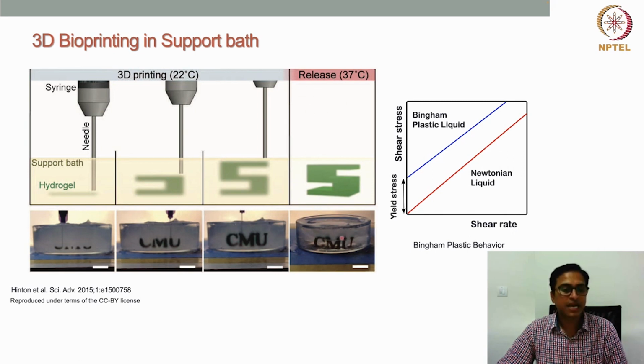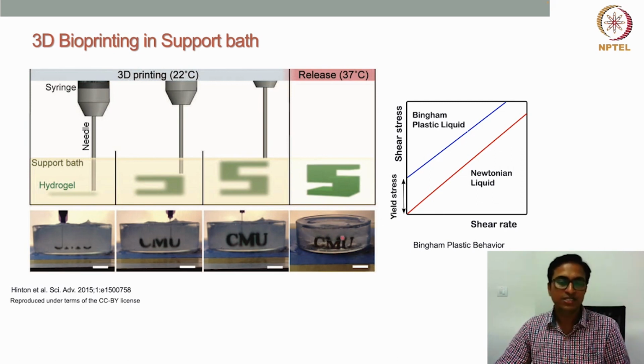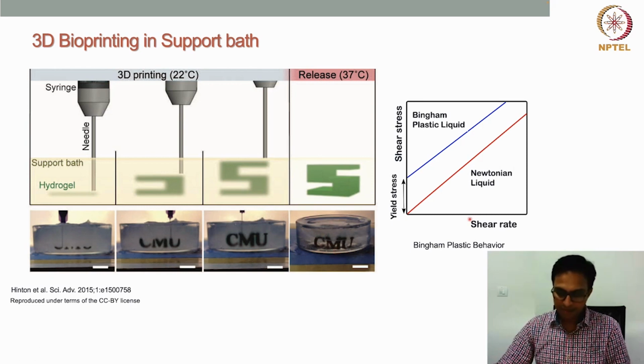And by that time, this printed structure can also get solidified, if we can introduce some cross-linking, some gelation mechanism here, so that the hydrogel can also get gelated. So this is the main.